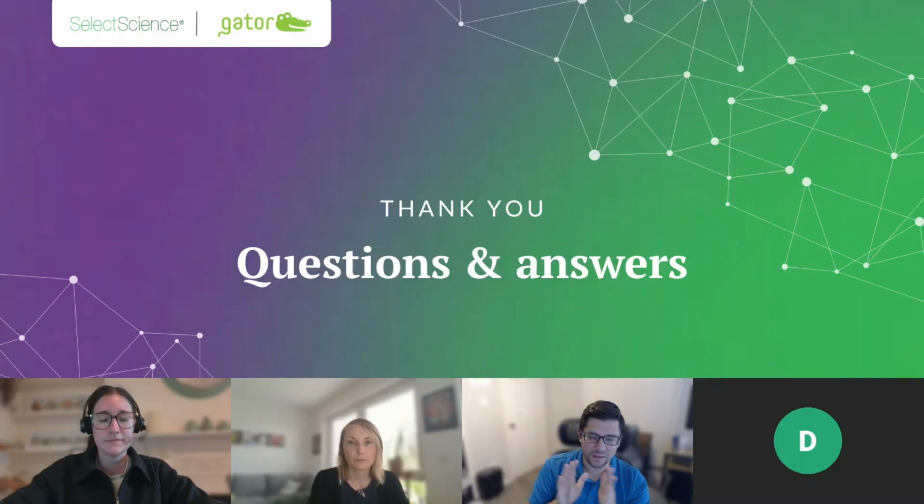Yes, we can get into the kinetics, right? And yes, we can optimize the experiment. But for a screening approach, all you need to know is yes, no, is there something there? And does it stay on? What's the K off? Get a general idea of the KD. So that's how you typically will approach this. You say, let's set it for 2 minutes capture time. You bind as much as is there, and you see how much there is at the end, and then you optimize. Because again, when you're doing cell-free, you're trying to get answers quickly, and you accept that you don't know some things when you run that first experiment.